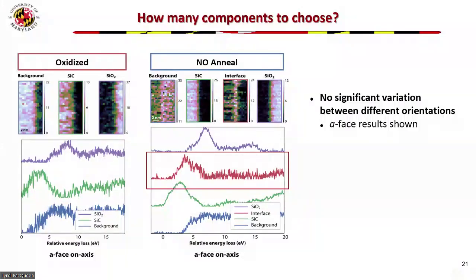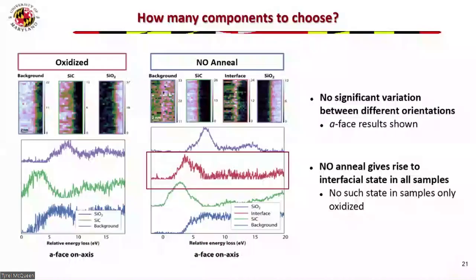So this, basically, I just said that. So this was the same basically for all samples, in particular for the A phase, but this is analysis of the silicon L23, and it basically shows all of the samples show the same thing, that there was an interfacial component.